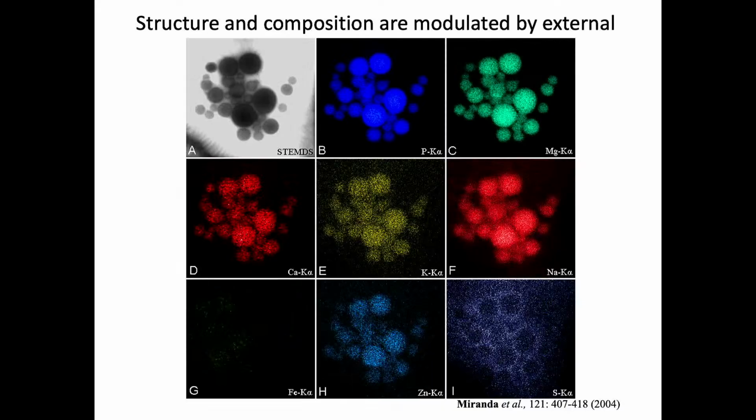If we combine these techniques with X-ray microanalysis, in this case we did energy filtered STEM. We used the energy filter just to do contrast tuning, as the samples are too thick to collect elemental signals. We use the X-ray detectors to get the elemental composition. So there we can see phosphorus.